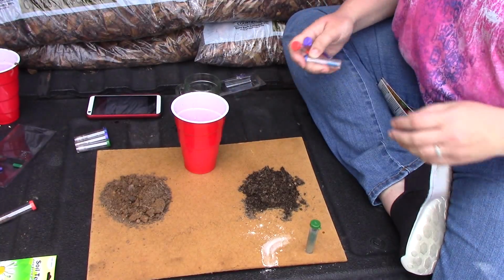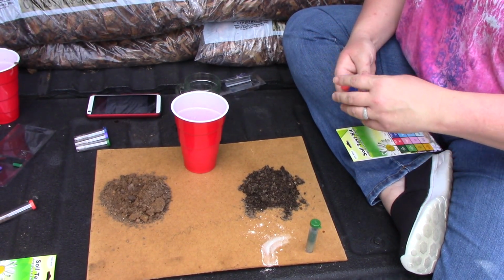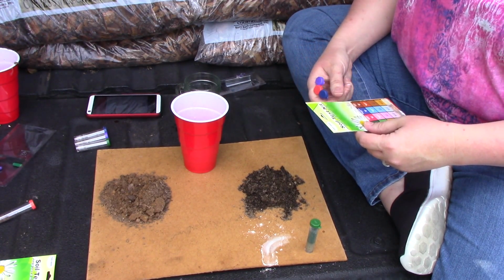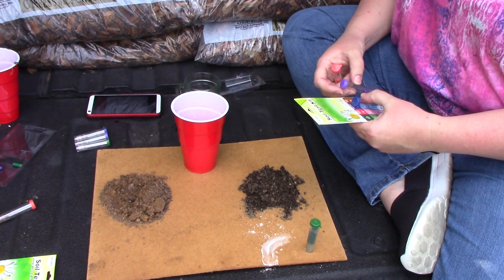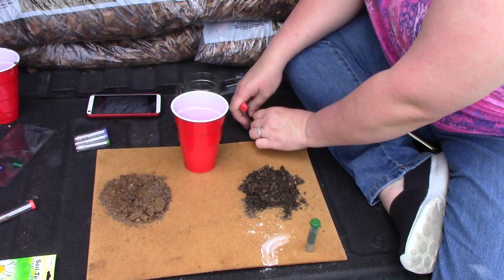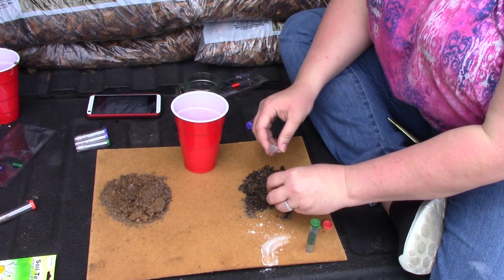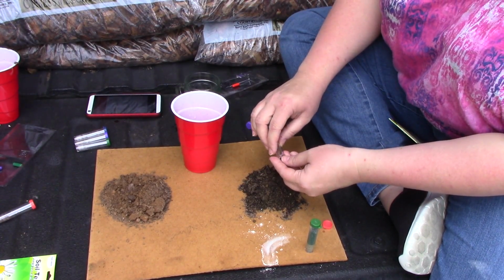Now the others, the nitrogen, potash, and phosphorus, you do those differently. The colors on here are not exactly right. They had the purple in the place for the one. But anyway, we will take them out. I'm going to take the little peel out of the nitrogen one, and I'm going to put it over to the side. And I'm going to put the same amount of dirt that I put in before, up to the 1st line.